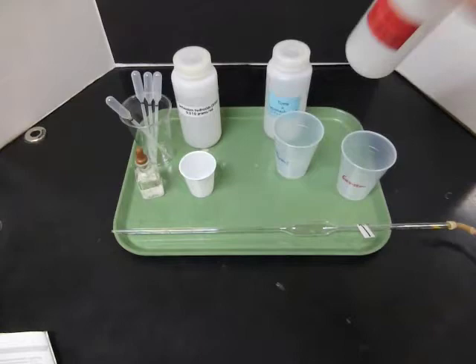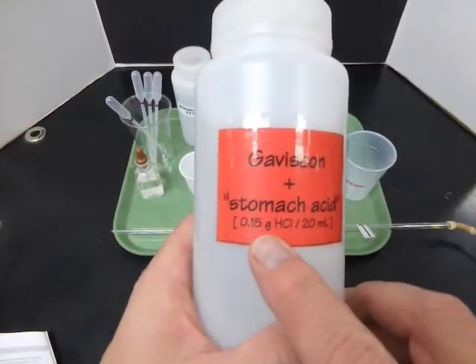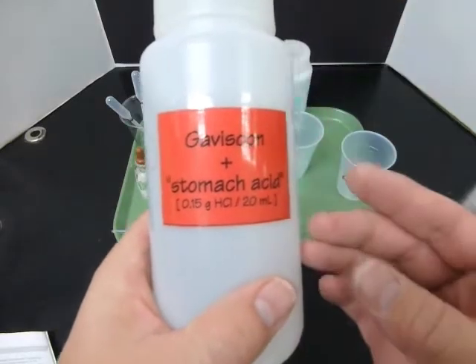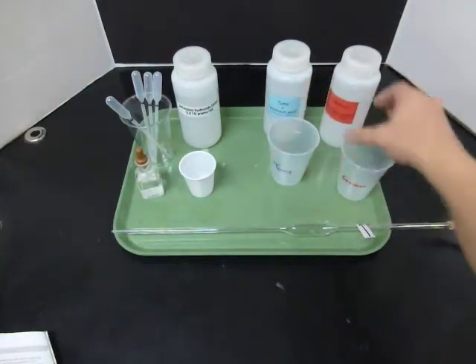I did the same thing for the Gaviscon. I made the same solution. 20 milliliters has 0.15 grams of acid in it. Put in some Gaviscon and let it use up some of the acid. We'll find out how much acid remains in the samples that we titrate.